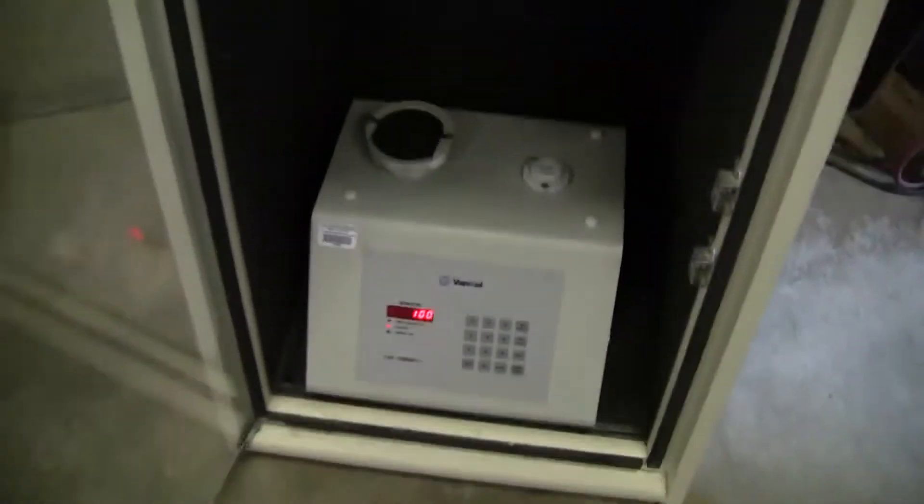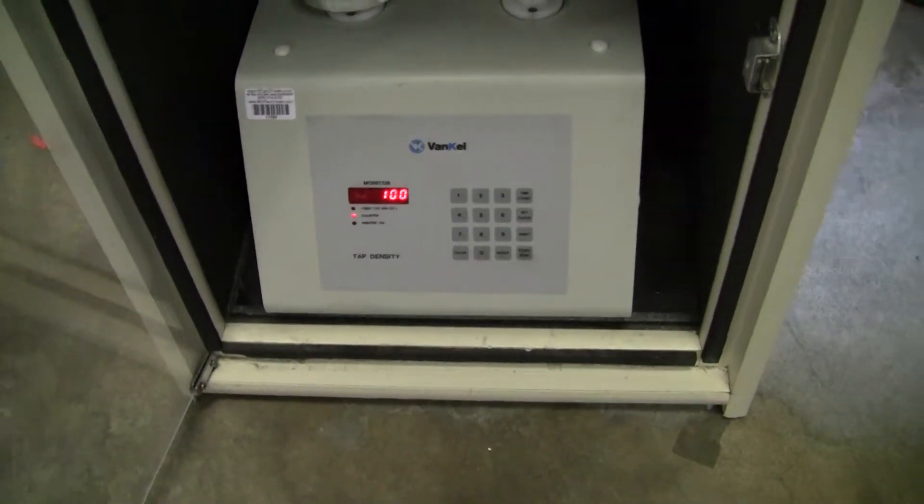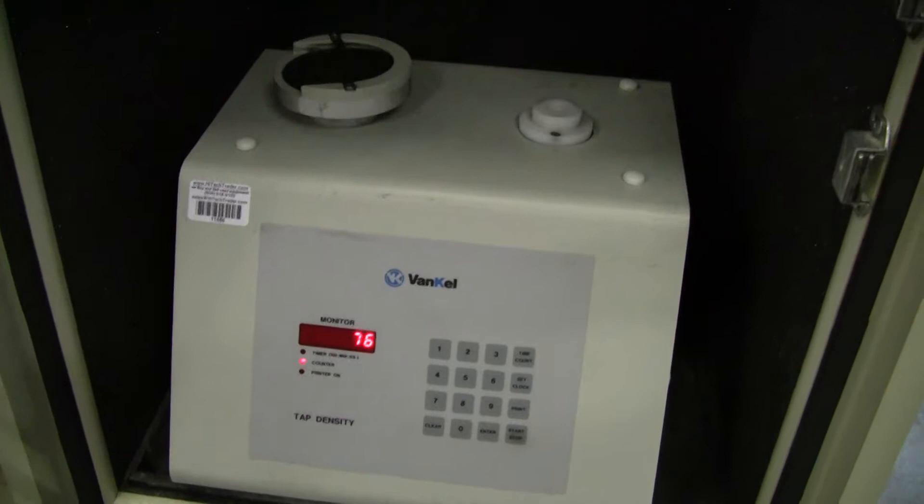We have it on counter right now. So we're going to turn it on, take a listen. Let's see, counting down from 100. Let's close the door.